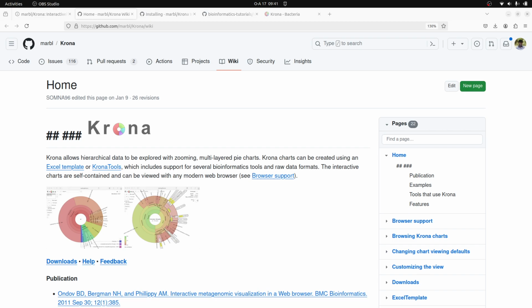In this video, I'm going to show you how to install and set up this tool, that is KronaTools. We are going to set it up on a Linux system. All right, so that's the only requirement, and you should also have Perl installed.